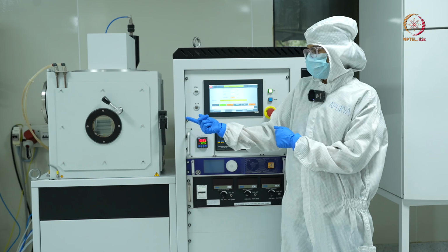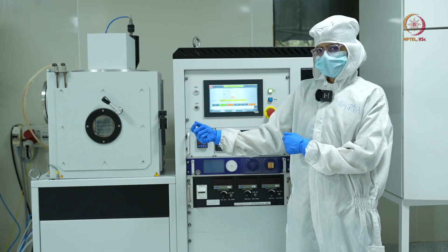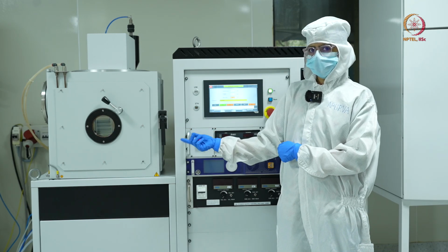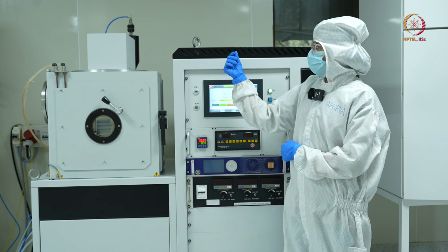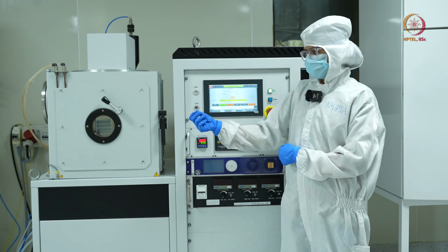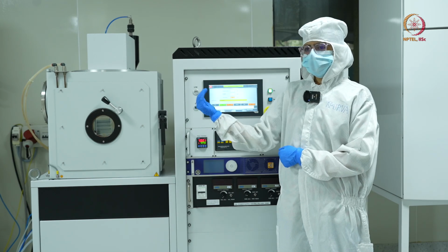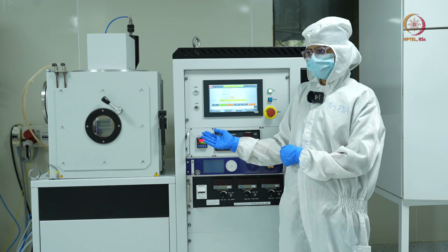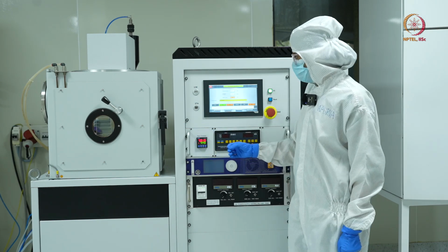Now, if you can hear, the rotary pump has started, which will take down the chamber pressure to 10 to the power minus 3 millibar. Once that is done, the turbo pump will come into action, and the pressure will be further reduced from 10 to the power minus 3 to 10 to the power minus 6, or the desired vacuum pressure required for the deposition.